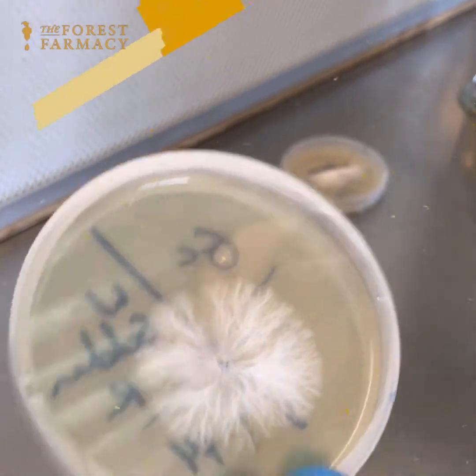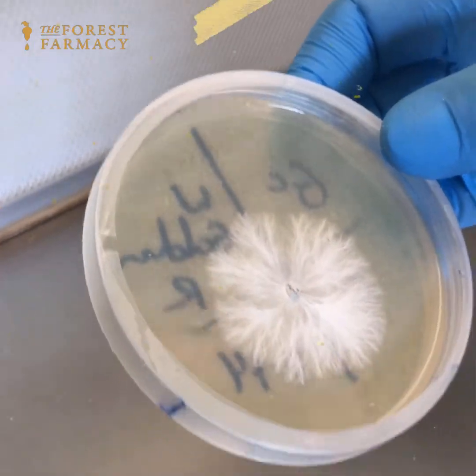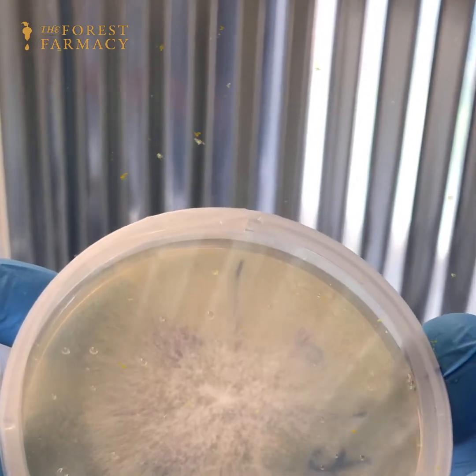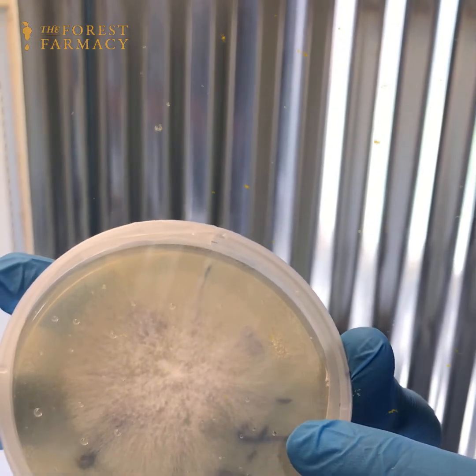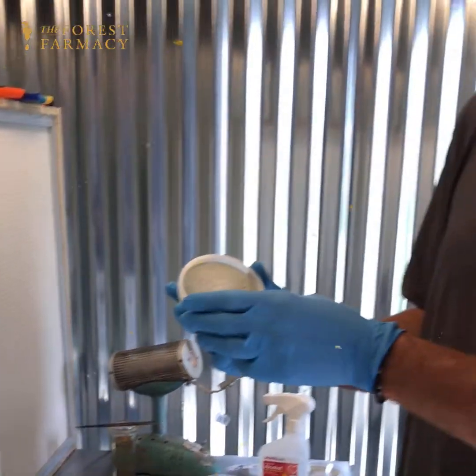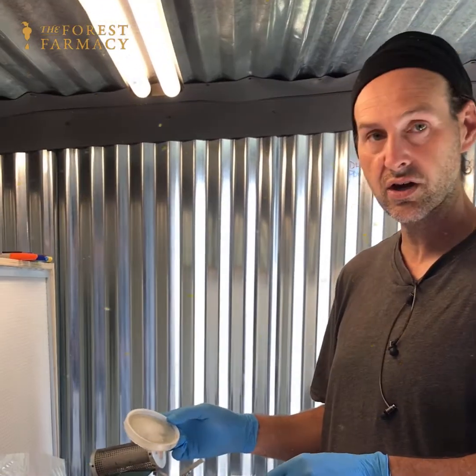I just wanted to share that with y'all. I'm going to be inoculating some grain with this today and we'll see how that grows out. We also have a petri plate of shimafuri hirataki, and what I'm going to be doing is inoculating the grain we have here in front of the flow hood — a quick transfer of colonized agar into some sterilized grain.